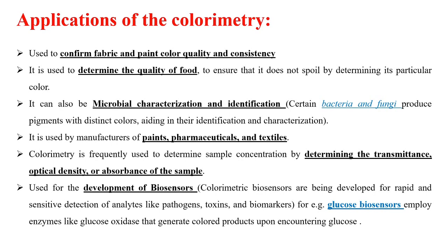If you see in those glucose measurement devices or sensors, you have this color analysis. When the glucose comes in contact with that sensor, that color will change. So to quantify how much glucose is present, you need to measure the color of that sensor, right? So in that case also we can use this color analysis.